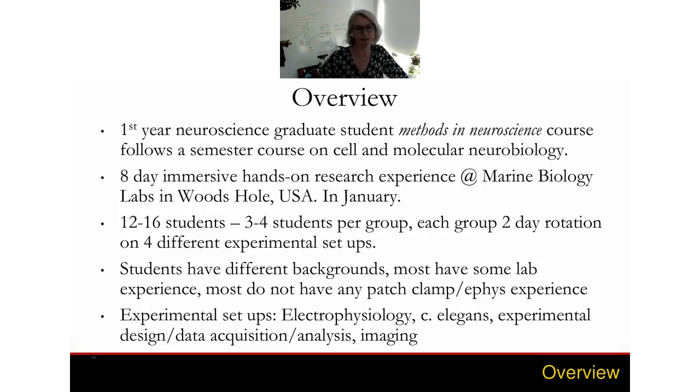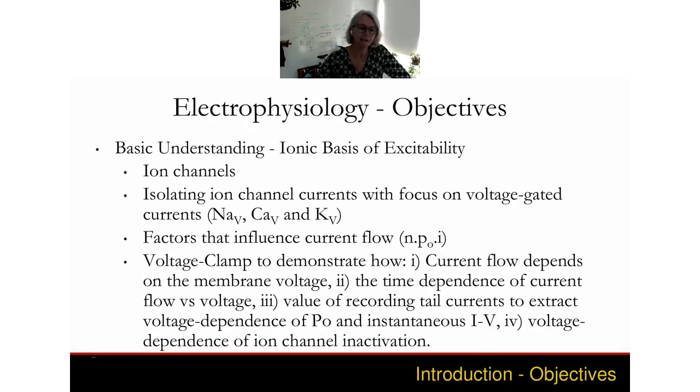The other rigs, just for completion, in addition to electrophysiology: we have a C. elegans experimental setup, where they do experimental design, data acquisition and analysis, and also typically there's an imaging setup as well. So that's the course background.